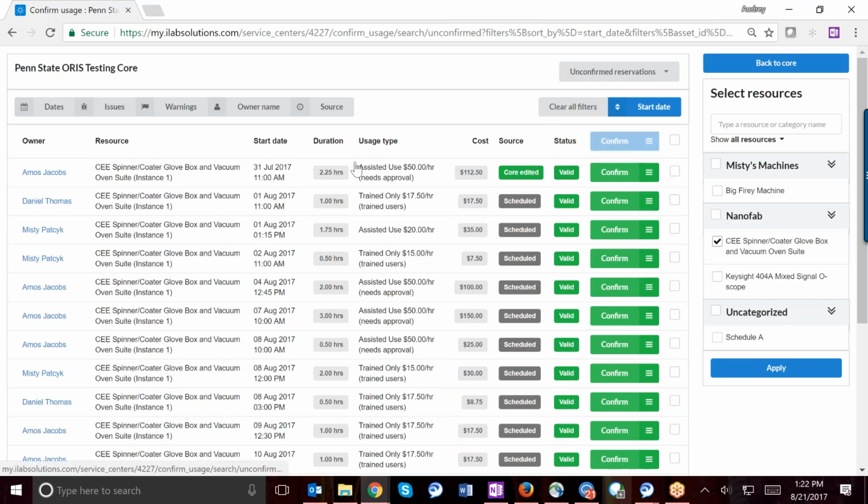And then when I do make any updates, so I adjusted his time, I can see that source has updated to say core edited. At that time, once I've looked over these, I'm all ready to go. I want to bill for all this.